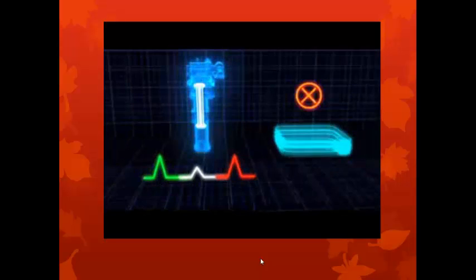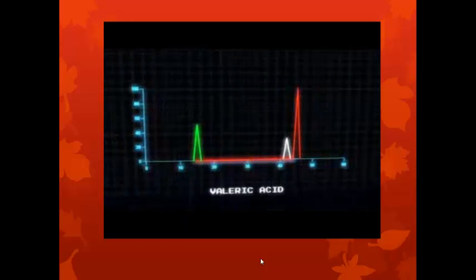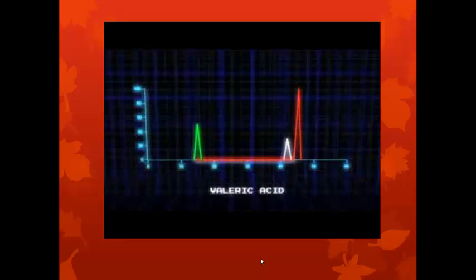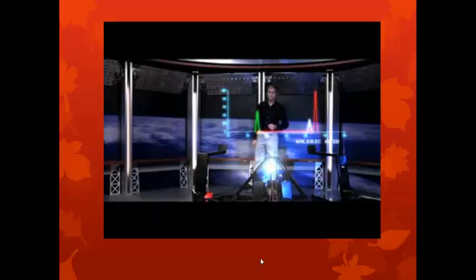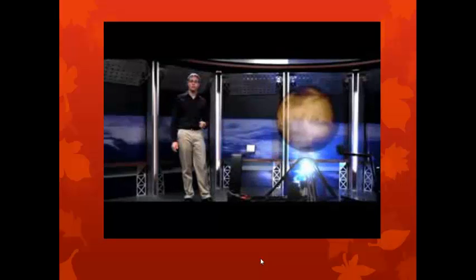After this, the fragments hit what's called the detector, and scientists record the data. If you're looking for more than one kind, the analyzer can scan across a range of fragments, building up a record of not only what kind, but how many. Once you have these results, called a mass spectrum, you can verify that your sample in fact contains what you're looking for. And here, the real work begins. The mass spectrometer is a powerful tool, and by taking many samples, looking at the results, and studying what we find, scientists can work to discover not only the secrets of water and life on Mars.